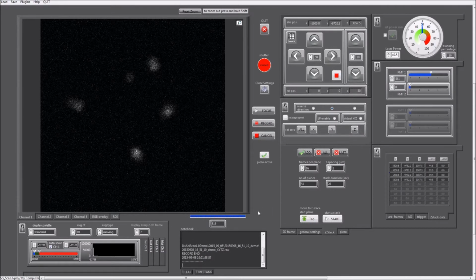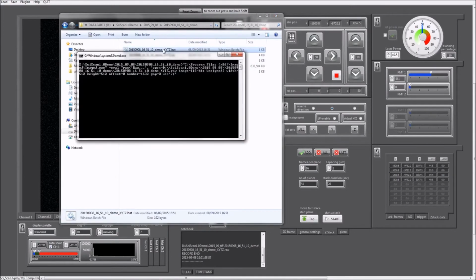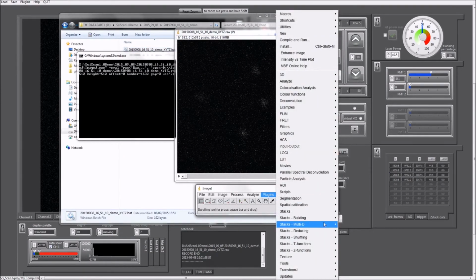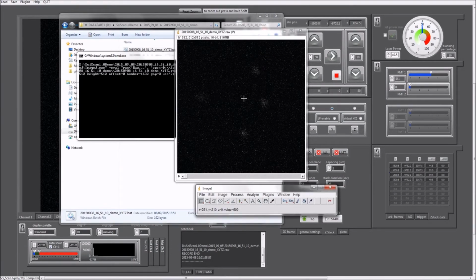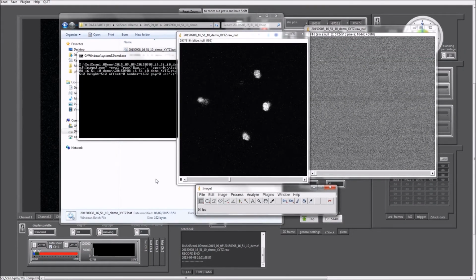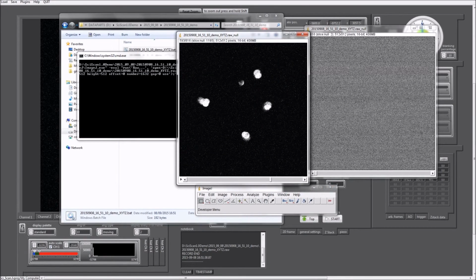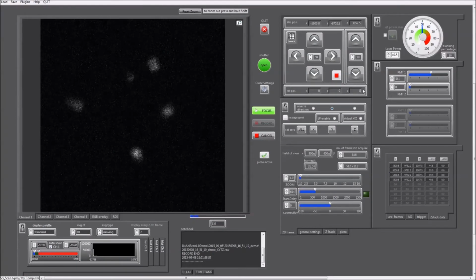Once that is done, we can then move over to our file structure and just see what we've recorded. Again, date stamped folder, date and time stamped folder with experiment name. And then in here, just double click the batch file. It comes up in ImageJ. I'm going to use my deinterleave. Got my 2 channels here. And now if I run through that, you can see how the pollen grains come into focus and run through that whole Z stack. I'm going to speed up the video here while I'm bringing those pollen grains now back in focus after our Z stack.